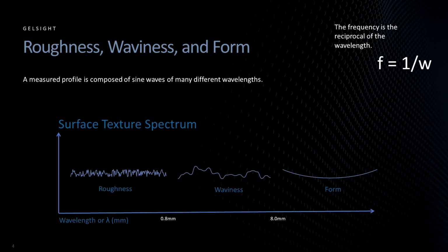In today's webinar, I'm going to focus on the analysis of a 2D profile instead of an area or a 3D surface measurement, simply because it's easier to visualize. But keep in mind, the concepts are very similar when analyzing a surface or a profile.